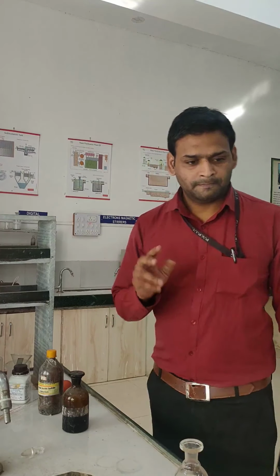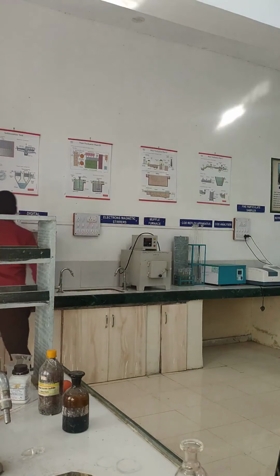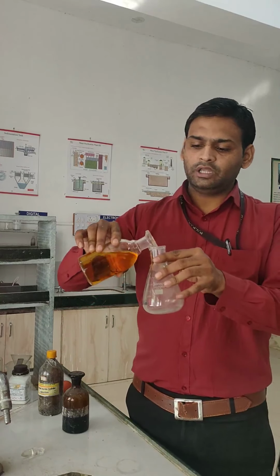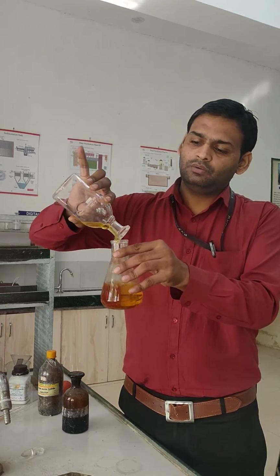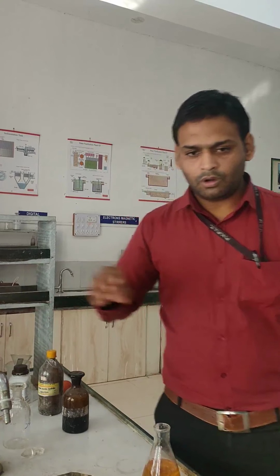So we are adding this water sample into the conical flask, and we will be adding the starch indicator into this water sample.